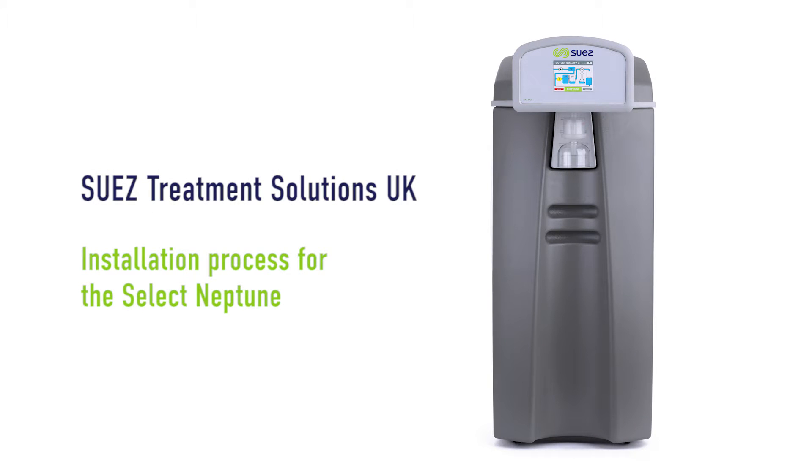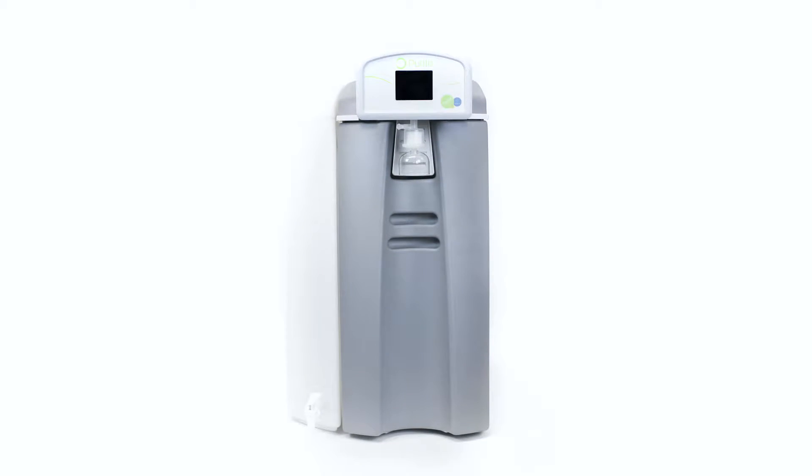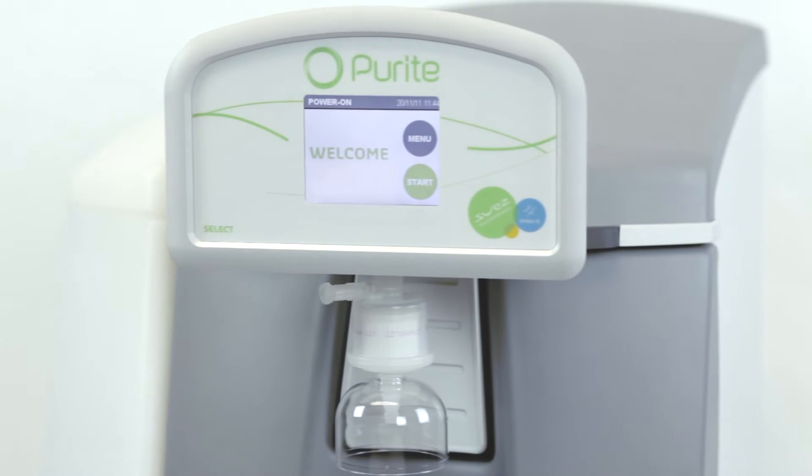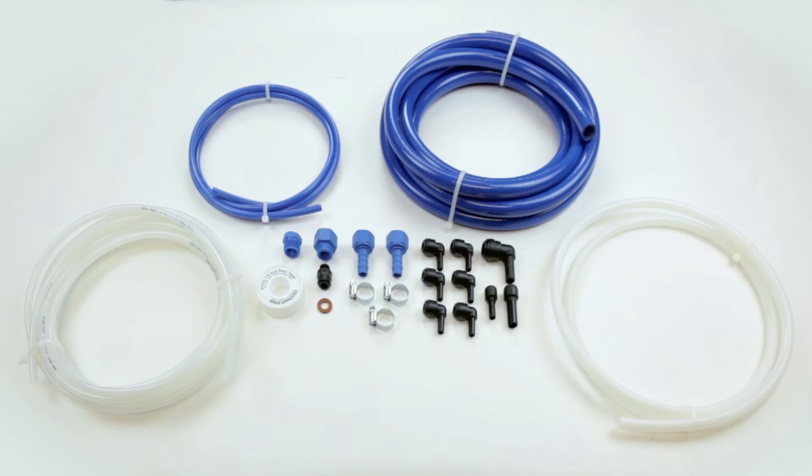This video will show the installation process for the Neptune polisher. The Neptune polisher must not be connected to a raw water supply, but should be fed with purified water. This model can be wall or bench mounted, and the installation kit comes complete with all fittings to allow easy installation.